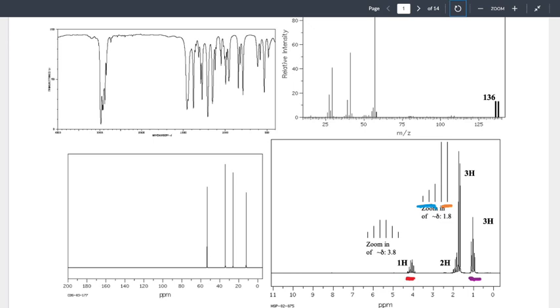And at the end of the experiment, when we ask for the integration, what it's going to do is look at the area underneath that curve, and it's going to say that this is 2, 1, 2, 3, 4, 5, 6, and this is 6.